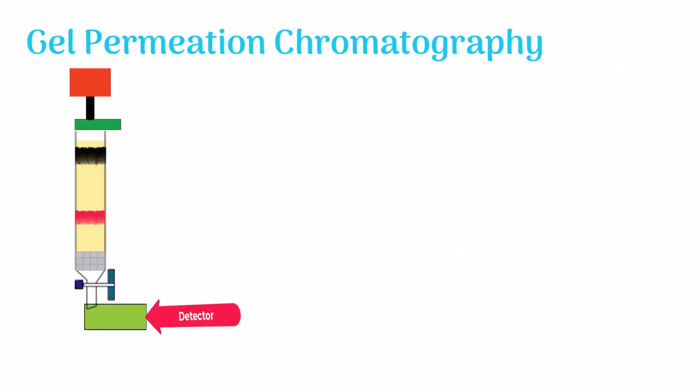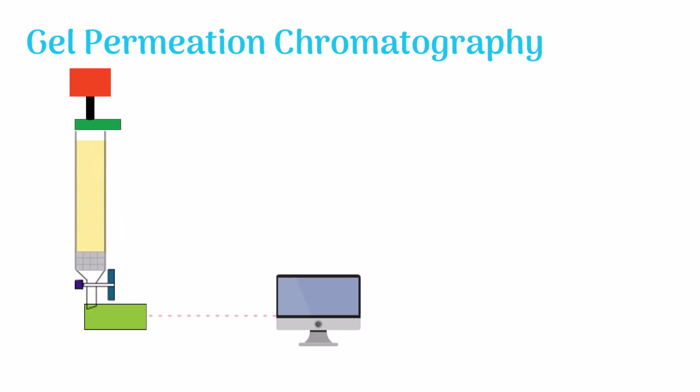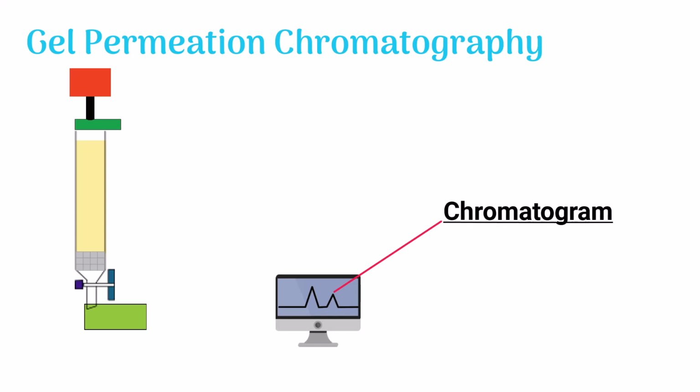The detector detects molecules when they escape out from the column. It then sends signals to a computer, which displays them in the form of peaks on a graph. This graph is also called the chromatogram.